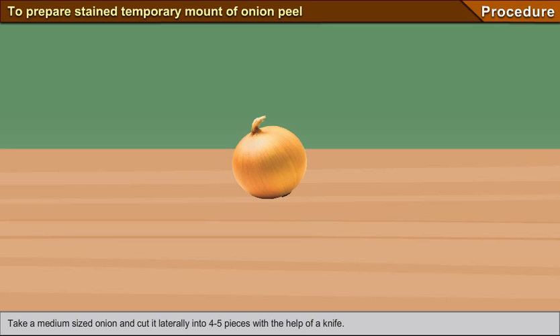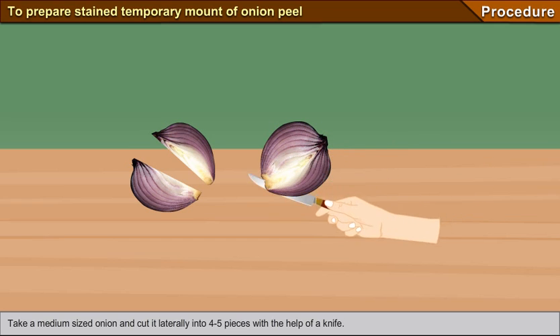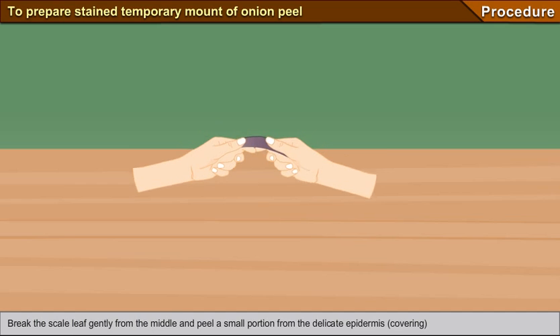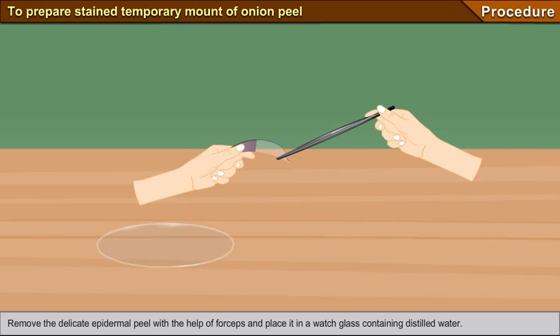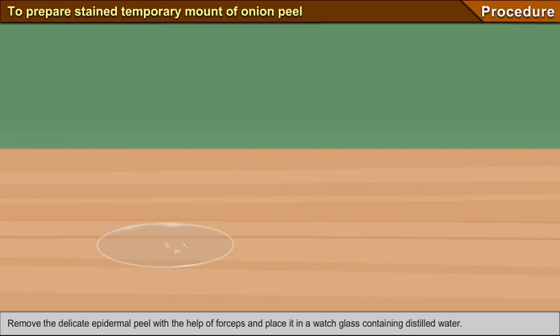Procedure: Take a medium-sized onion and cut it laterally into four to five pieces with the help of a knife. Remove a scale leaf from one of the pieces. Break the scale leaf gently from the middle and peel a small portion from the delicate epidermis — the covering that covers the inner surface of the scale leaf. Remove the delicate epidermal peel with the help of forceps and place it in a watch glass containing distilled water.